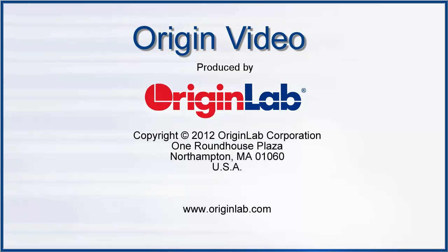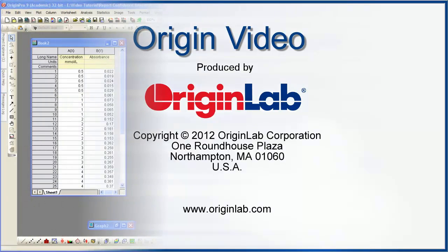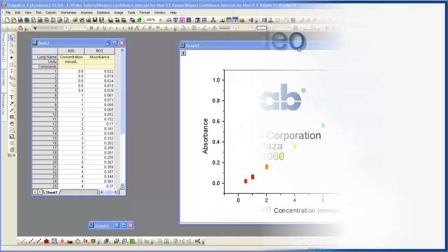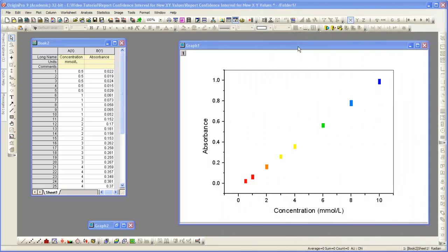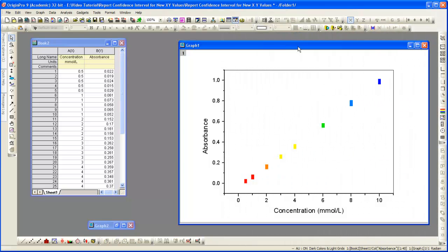In this video, I will show you how to create a calibration curve for absorbance versus concentration data from known samples, and then find the concentration for an unknown sample.